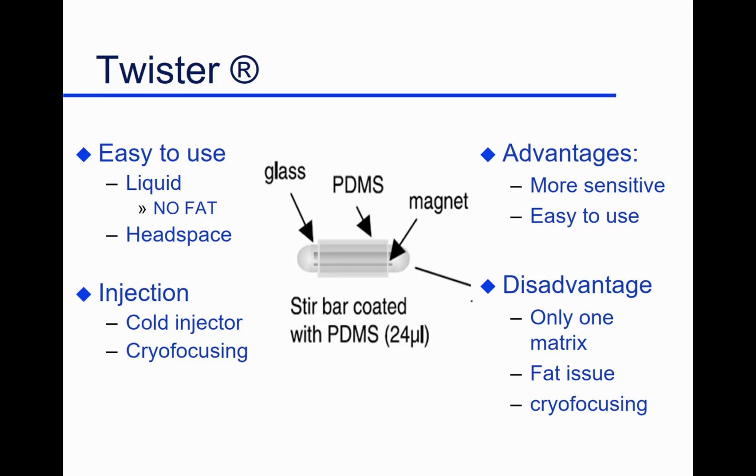What that is, is a fairly small glass stir bar. It's actually quite tiny. But that stir bar is coated with a dimethyl silicone absorbent. So you take this stir bar, drop it into a sample, and anything that likes this coating is going to be absorbed into the stir bar. You can stir your sample, and at some point you pull it out and put it into the gas chromatograph where it's hot. Flavor compounds, off-flavor compounds, pesticides, herbicides come off into your analytical system, go into the column, and are separated. So a stir bar is simply an adsorbent stir bar.